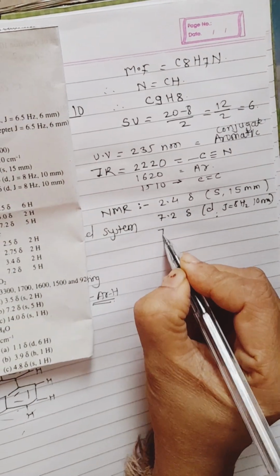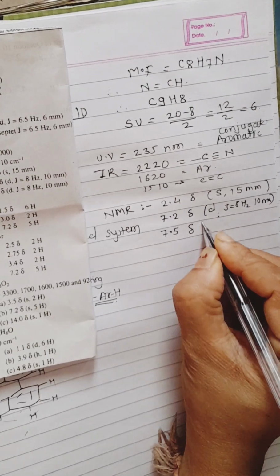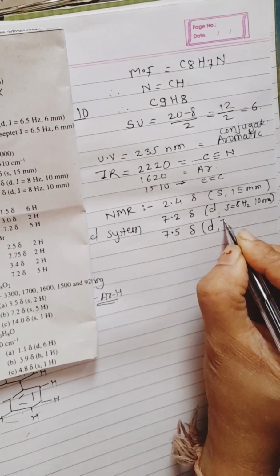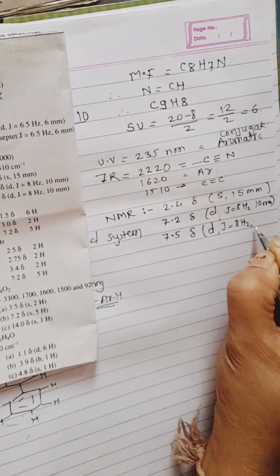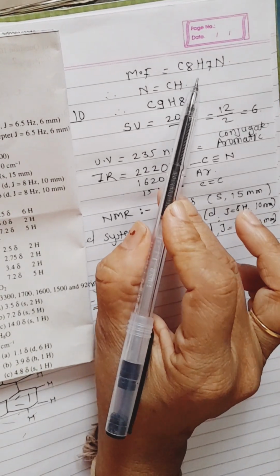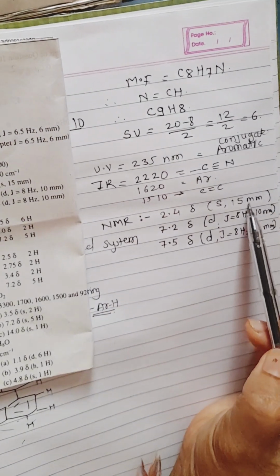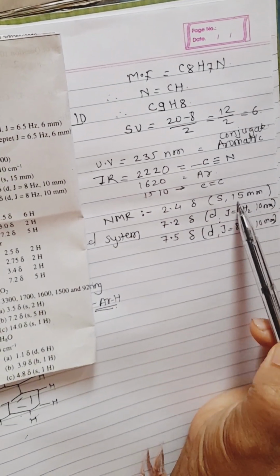Then the third data is 7.5 delta, doublet, J is equal to 8 Hertz and 10 mm. So friends, look toward the number of protons. Here it is 7, and as per that we have to find the ratio.